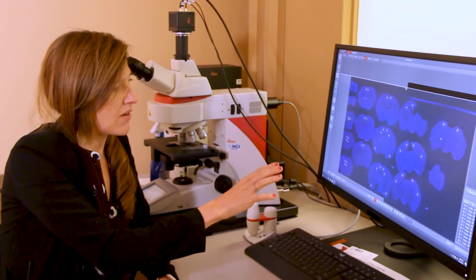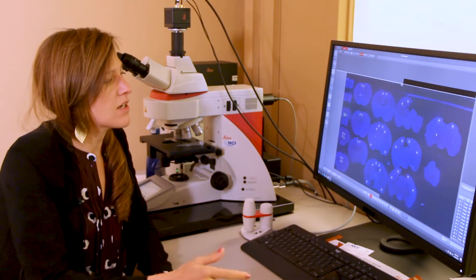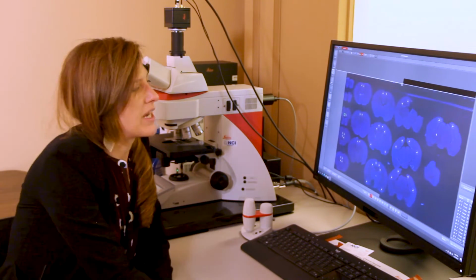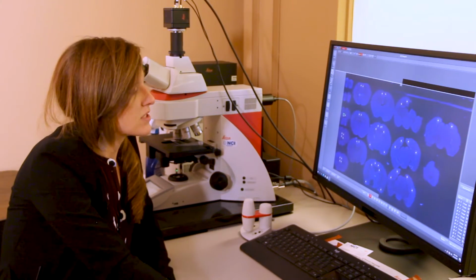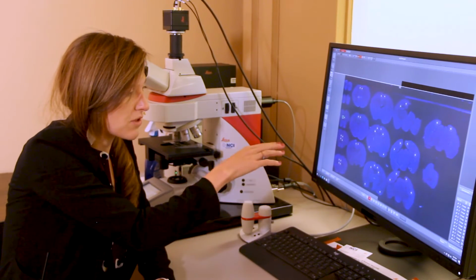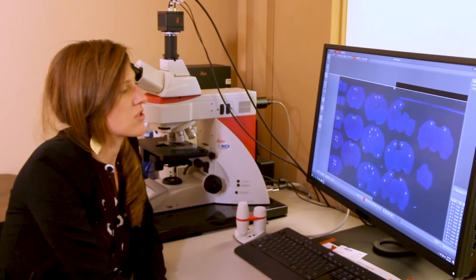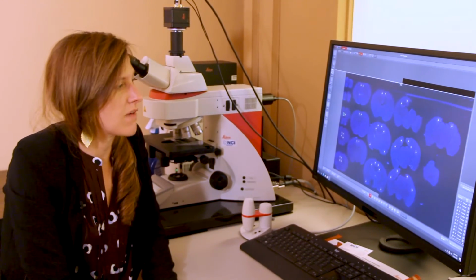So right now I have about 10 slices all within the same field of vision, and what I can do is click around and just navigate, almost like using Google Earth to click around a different neighborhood. So I can say, from a really broad perspective like I have here, I'm interested in looking at, say, the dorsal hippocampus. What I can do here is click, and I see where the dorsal hippocampus is here. Click, the microscope will go there itself and take a fine-grained detailed picture at something like 40x or 20x, whereas right now we're just looking at a 5x.